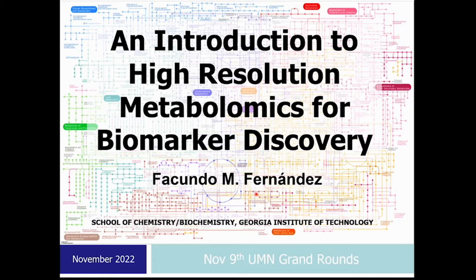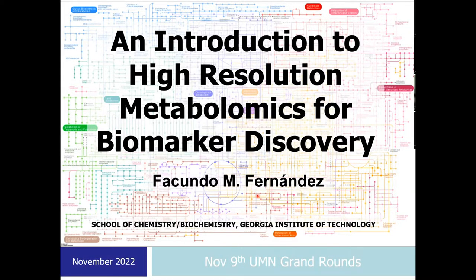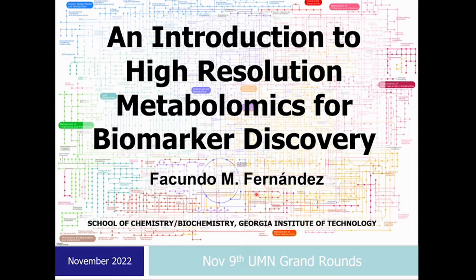So what I thought I would do today is give you an introduction to metabolomics. I'm sure many of you have heard of metabolomics, but I wanted to break it down, almost like a tutorial talk, to tell you what you do when you're doing metabolomics, what the challenges are, and what the potential pitfalls are. As part of that, I was going to use an example of one project that we have that is funded by the NIH that has to do with traumatic brain injury to illustrate what you can do, what you cannot do, and what to expect. Hopefully this will whet your appetite for doing metabolomics.